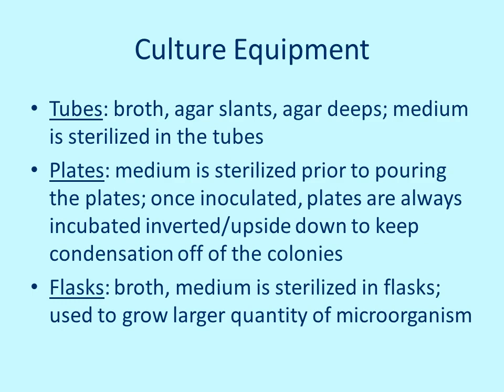Flask, sometimes we use these. It'd be a broth medium. The medium's going to be made and sterilized in those flasks. It's usually when you're wanting to grow a larger quantity of the microorganism, and you may be dispensing it into tubes afterwards.